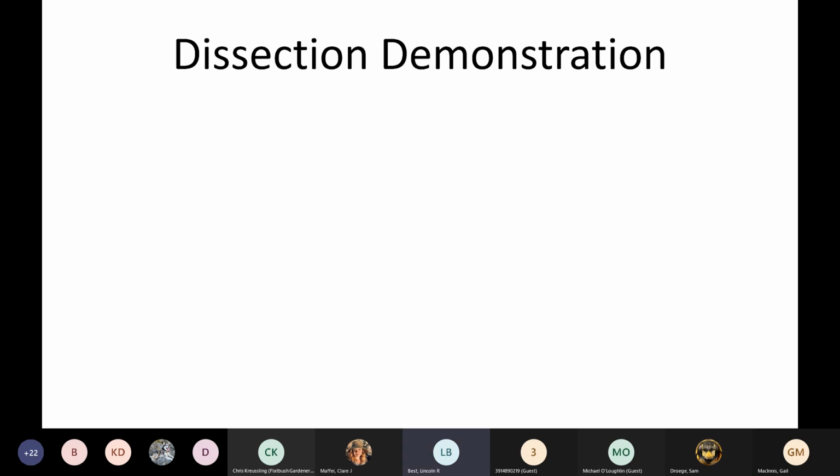If you're not worried about keeping the specimen in decent quality, you could probably just rip the abdomen off, rip it in half, and then find the characters you need, and update your row of data with the taxonomic information and move on.